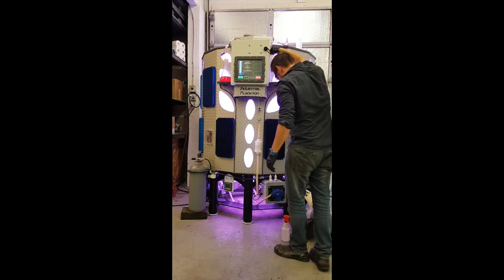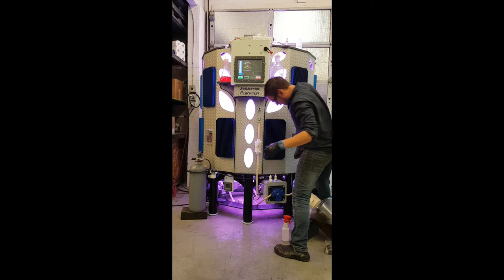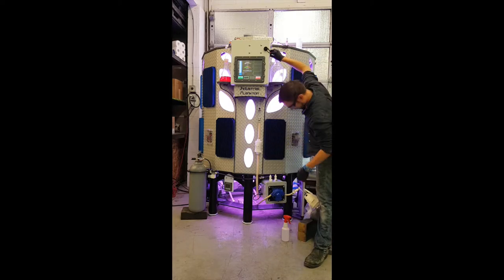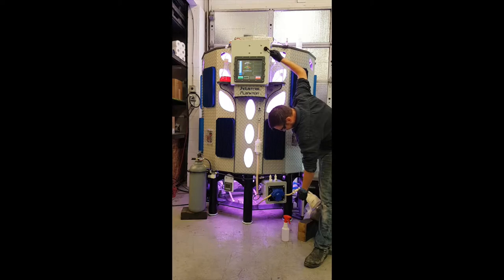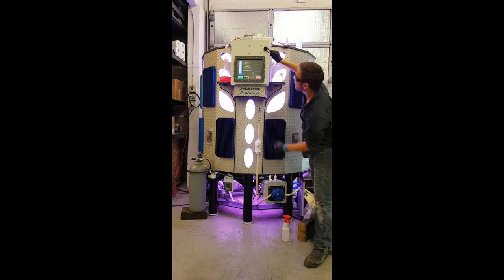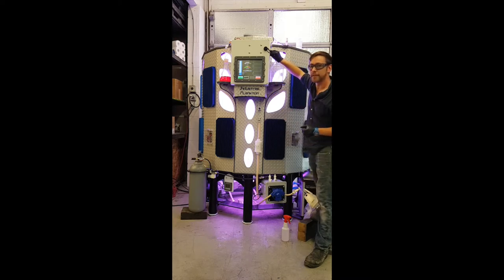We have this trigger switch up here that will draw the culture into the tank. As you can see on the optical density sensor, we're already showing a reading, which means the cells are going in.